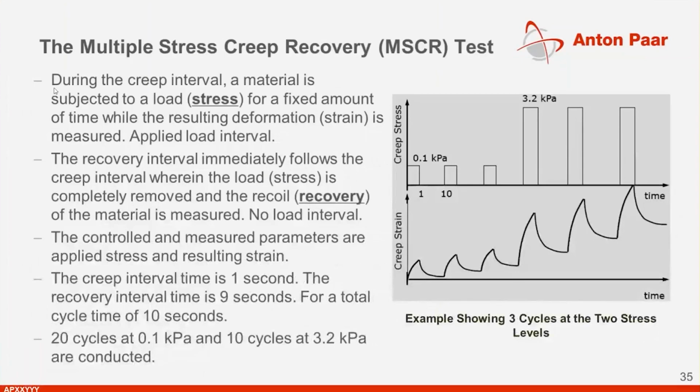The multiple stress creep and recovery test is performed at the high PG temperature on RTFO aged materials, and the control and measured parameters here are the applied stress, which is the force we need to deform the sample, and the resulting strain. We are applying a stress of 0.1 kilopascal for 1 second, directly followed by a recovery step where no force is applied.